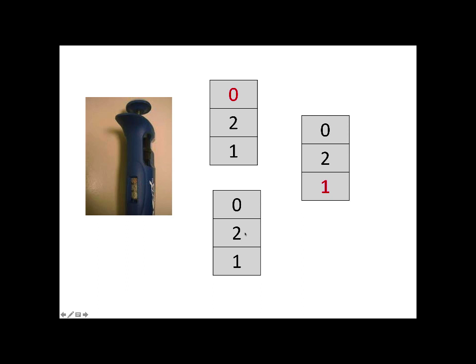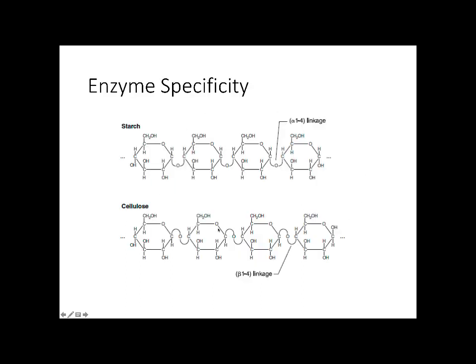So this would be 21 microliters. And then your P20, it has the red number on the bottom. This is your tens column, your ones column, and your tenths column. This would be 2.1 microliters. You should be really comfortable with this point in the lab at using the micropipetters and understanding their volumes.